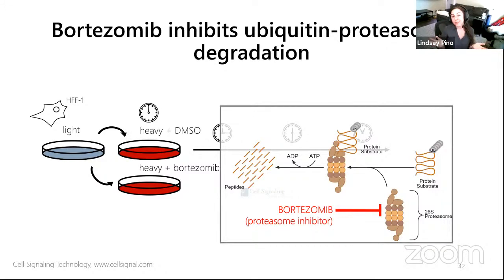So I haven't seen it in pulse SILAC. There are additional confounders with pulse SILAC that might change things. TMT takes advantage of isotopes, and pulse SILAC takes advantage of isotopes. It might work out because they're different isotopes, but at the same time, it might cause some interferences. It's a really good question, a good thought experiment. You could probably do some good in silico simulations to see if that would work.